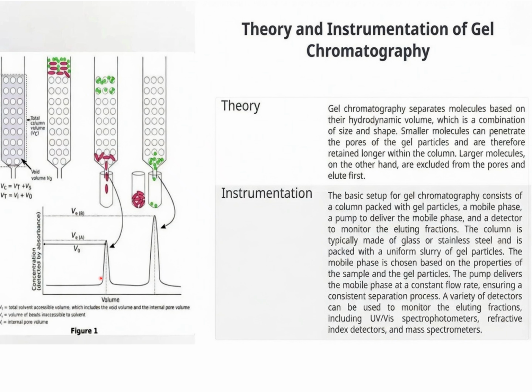By analyzing the peak, you need to understand the nature of the protein, the quantity of the protein, the concentration of the protein, or the presence of any impurities in your sample. Because if you have any impurities, several other peaks could appear here. So this is the overall approach for determining the protein's concentration or quantity in the sample.